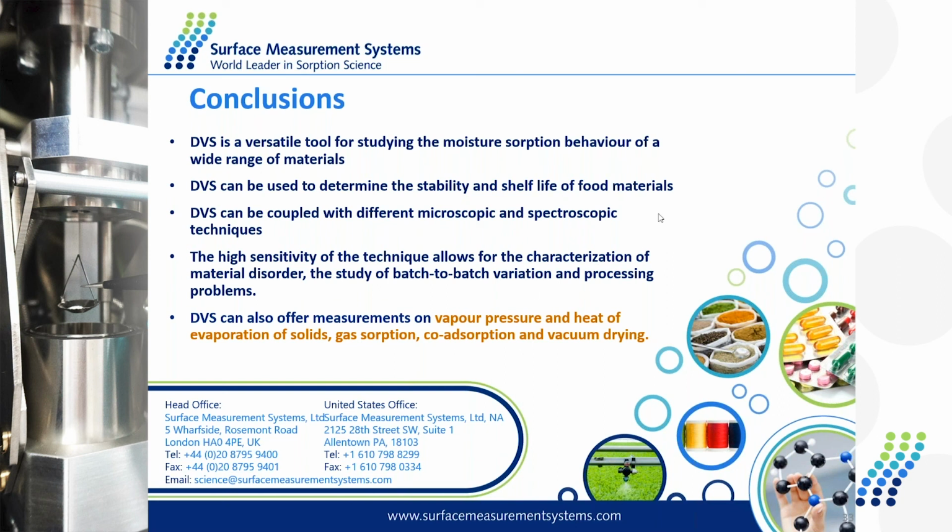We can use some tools in the market to cut the film in a certain desired area, like the one for the rubber bump. That kind of tool we can use to cut the film just the same area as the cell area. We use that kind of sample for the measurement.